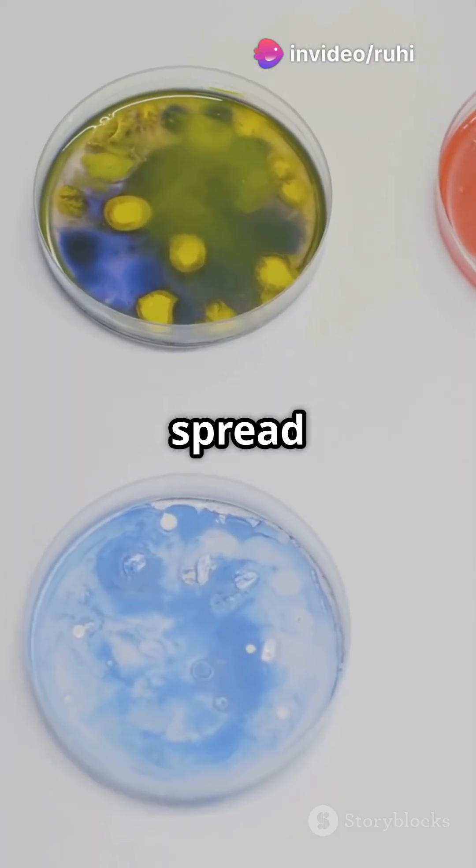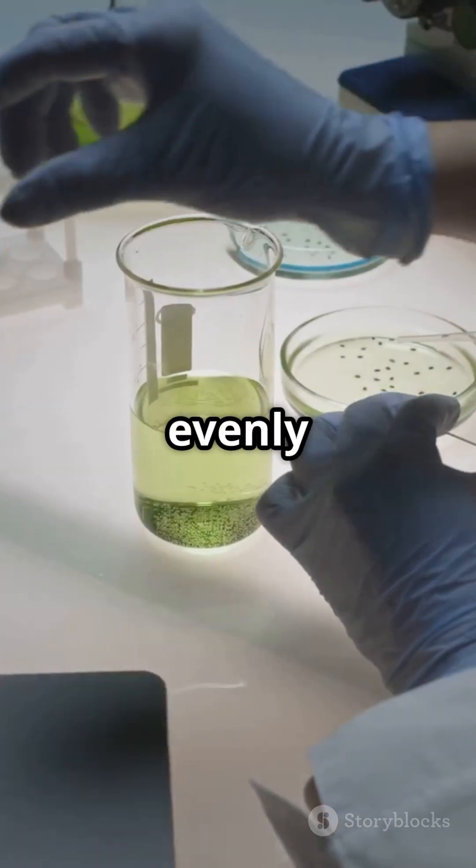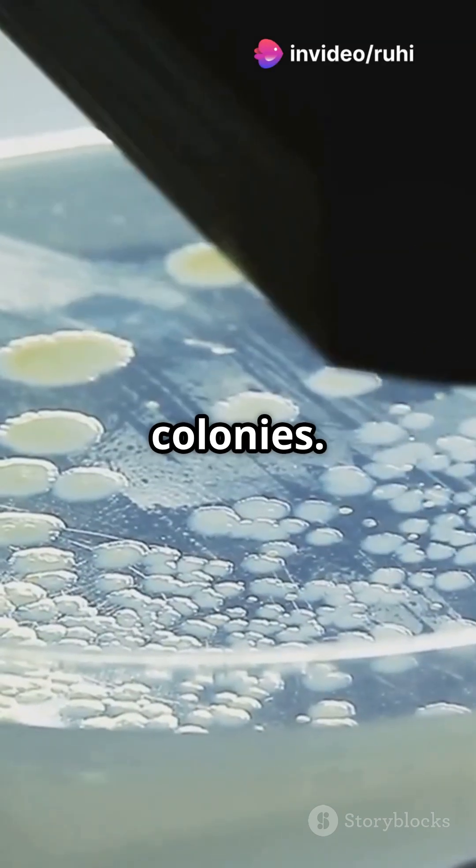Alright, here's the fun part — spread plating. Take a small amount from the last dilution tube and spread it evenly on an agar plate using a sterile loop. This helps us separate bacteria into individual colonies.